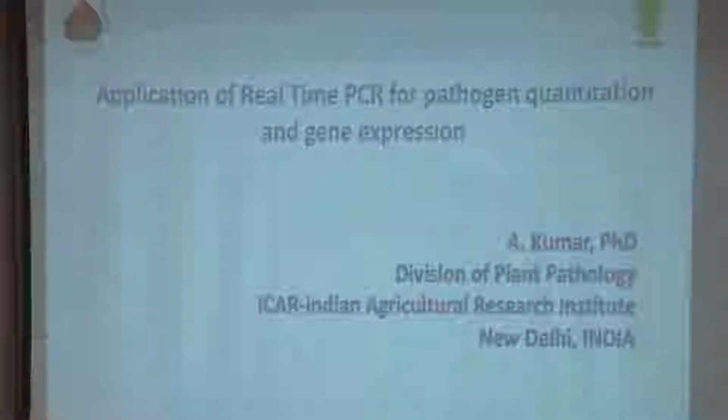There may not be any time today to carry forward this experiment into qPCR that we will do tomorrow. Okay? But before that, you need to know what is real-time PCR.